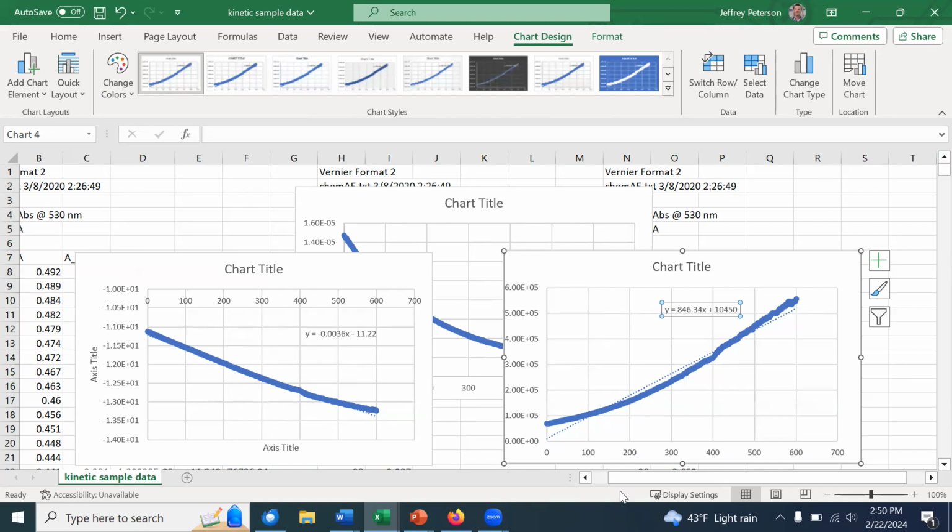From the linear plot, if it's natural log, if it's concentration, if it's 1 over concentration, you can determine the order of reaction. Review the pre-lab notes if that's not clear to you how to do that. And once you identify the linear plot, remember that the rate constant is equal to the negative slope. Slopes often have units, so make sure you account for that. That is how you will extract the rate constants in this data analysis.